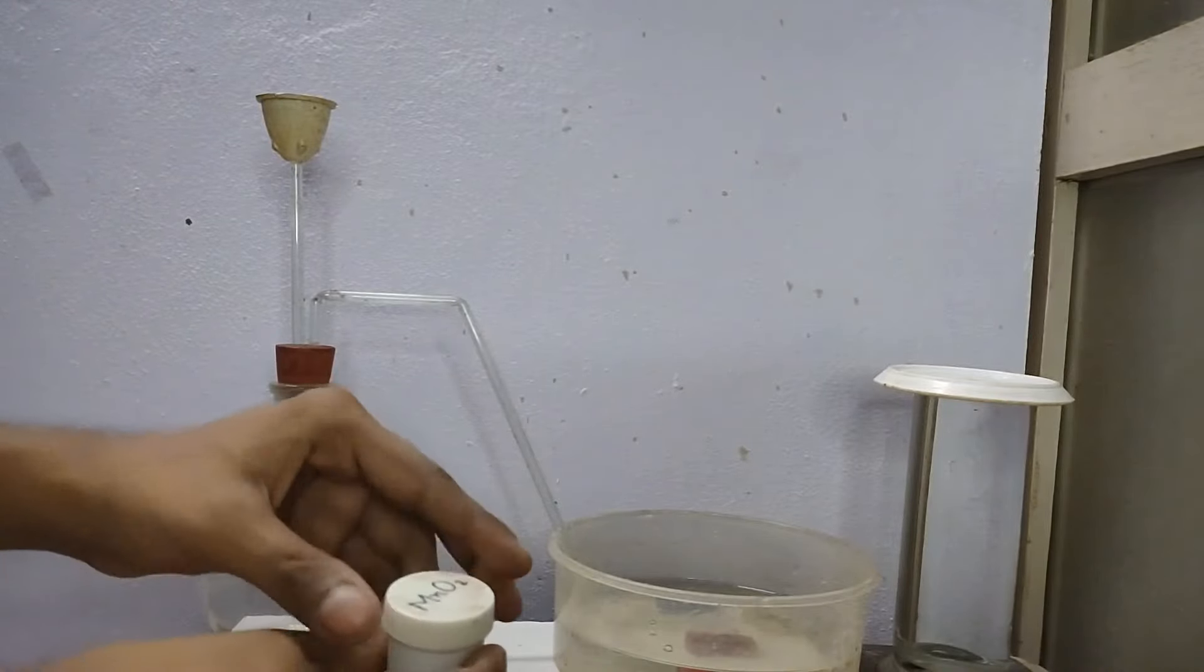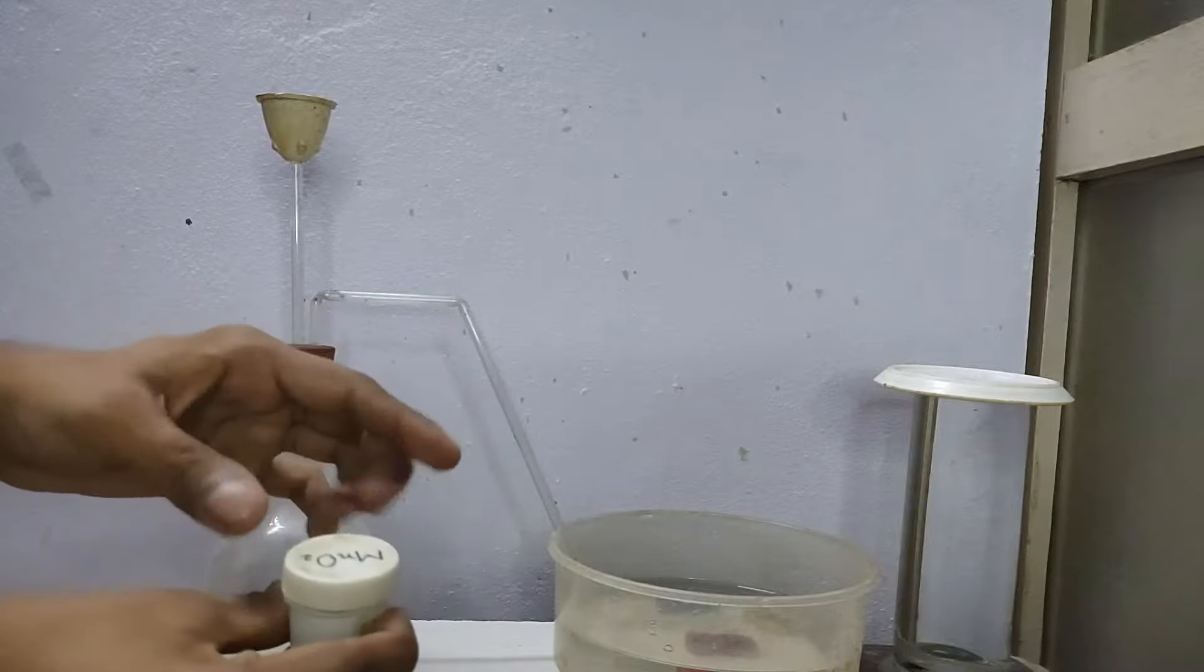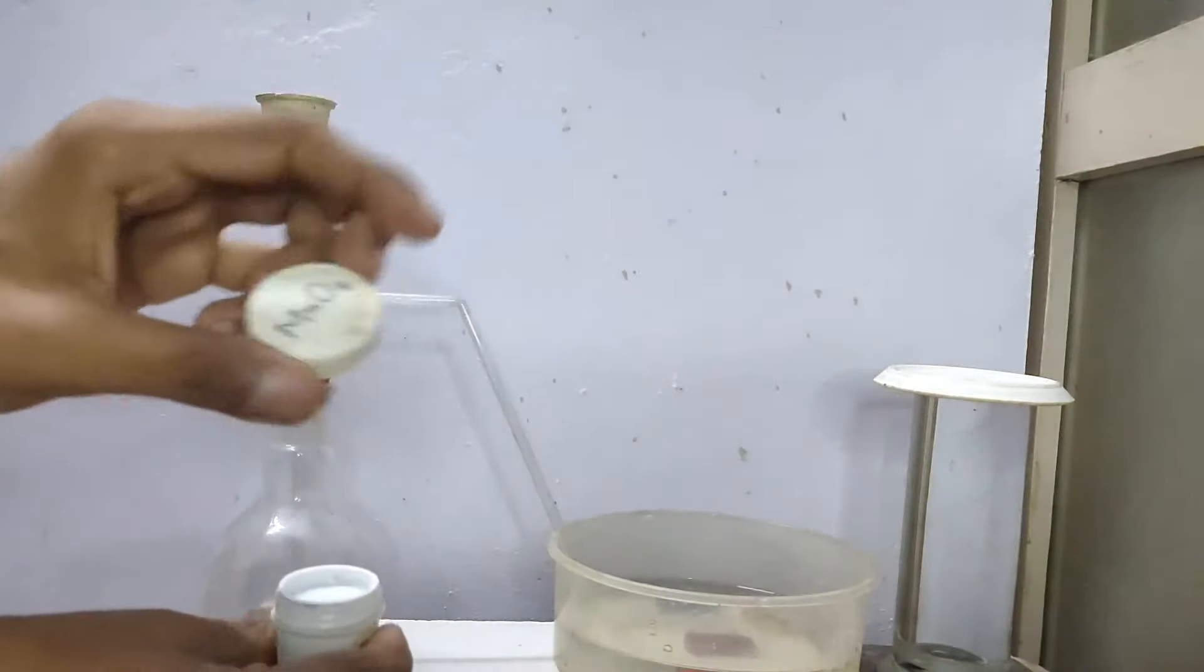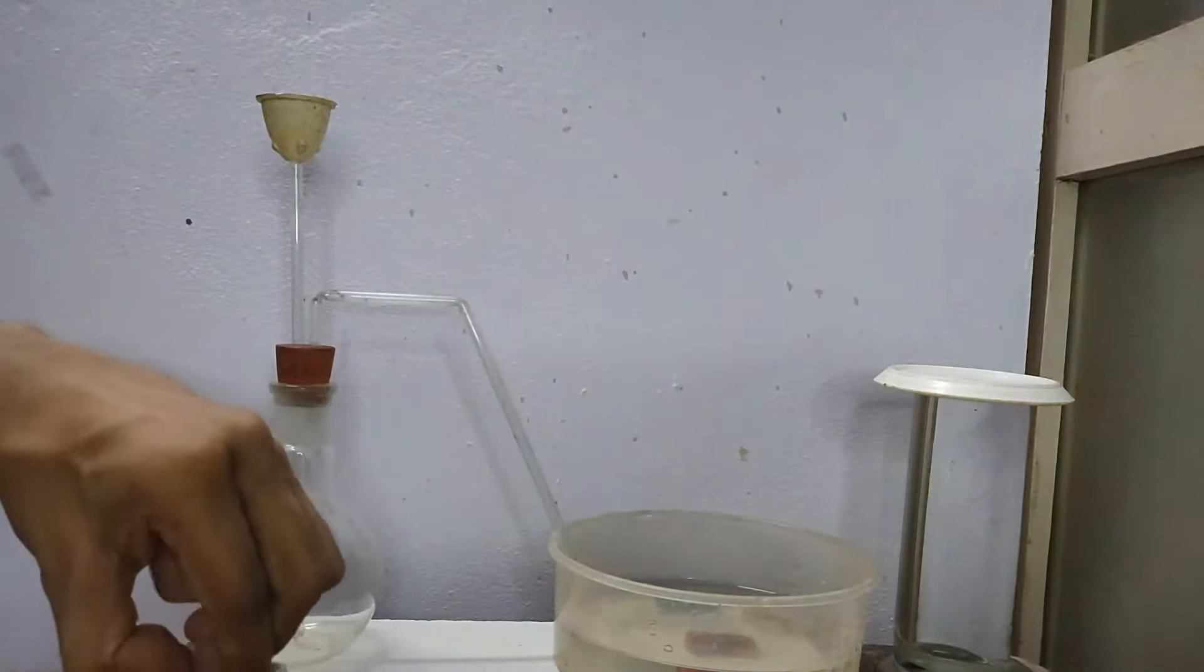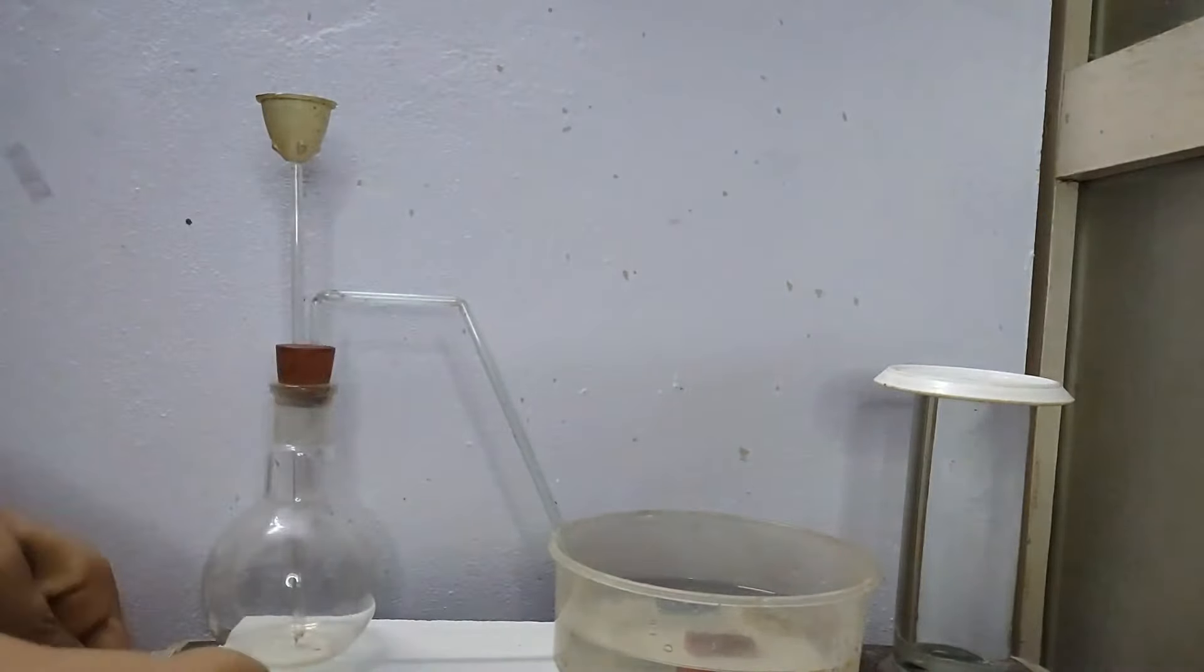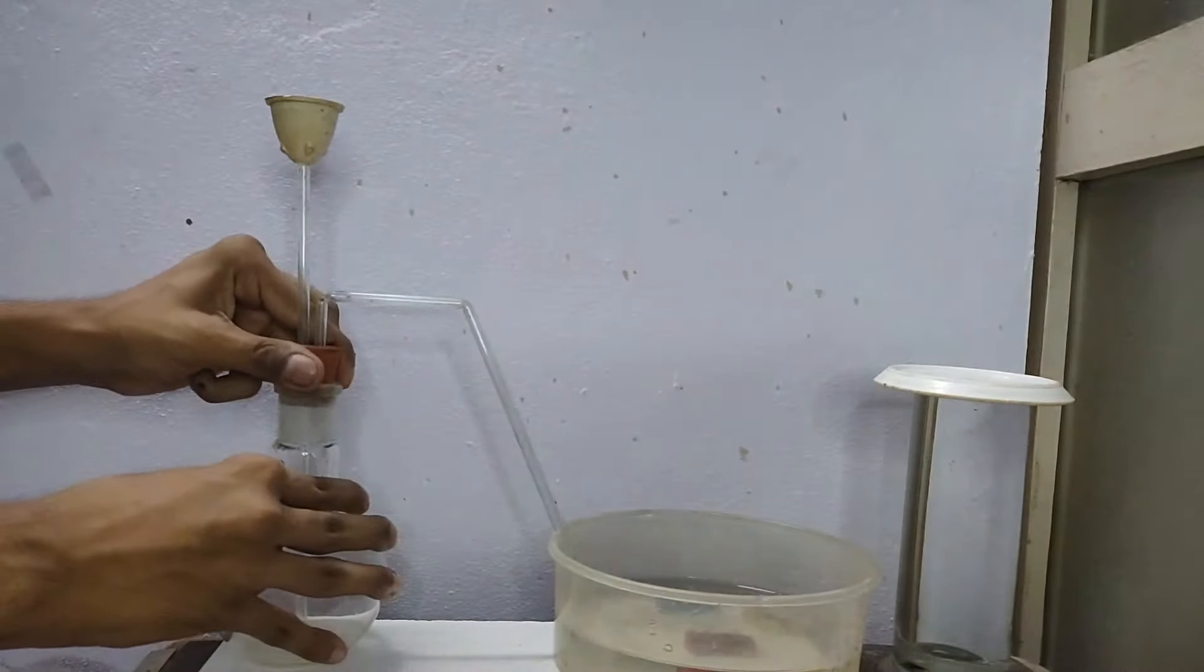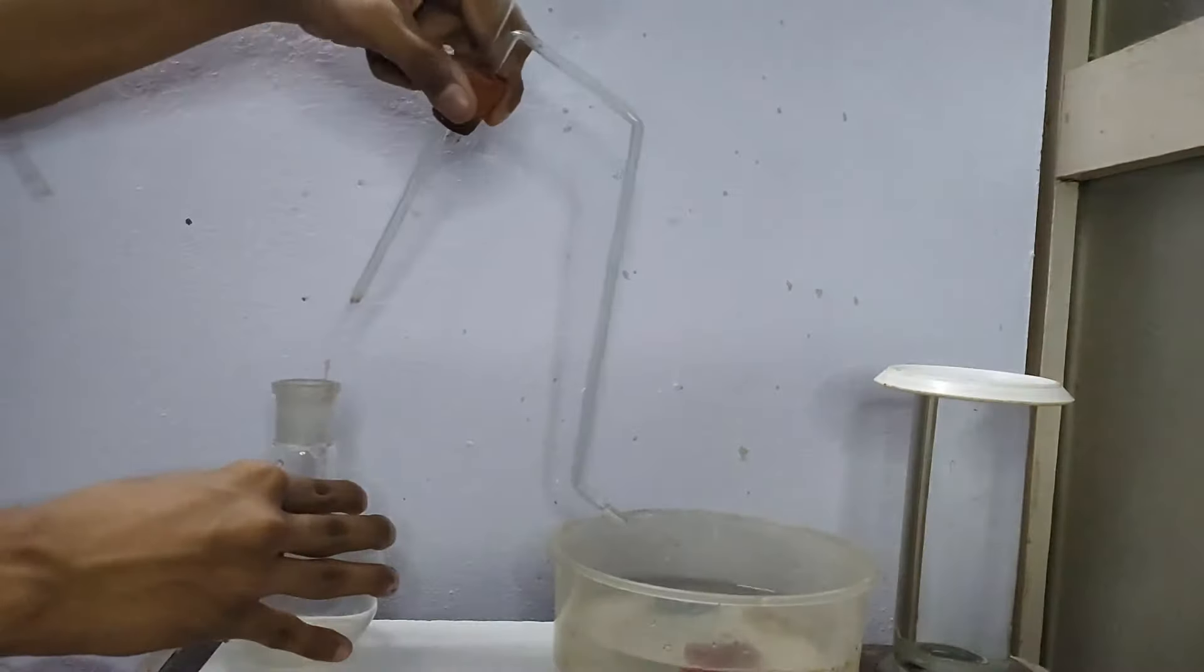First, this is manganese dioxide, MnO2. I will be placing this inside the flat bottom flask. So first I will take out the cork from the flask.